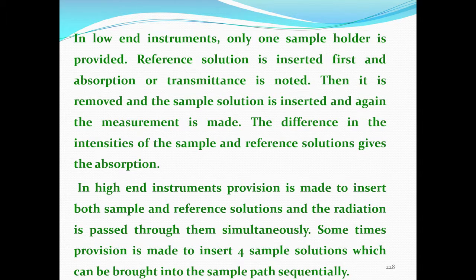In high end instruments, they normally put the sample and reference solution simultaneously in the same compartment and split the incoming radiation, one to pass through the reference solution all the time, and the other part is made to pass through the sample solution. Sometimes provision is made to insert 4 samples, 5 samples.